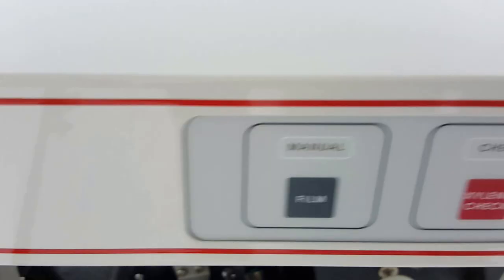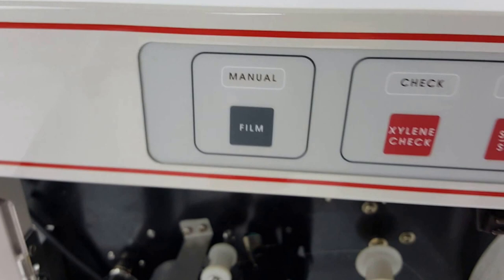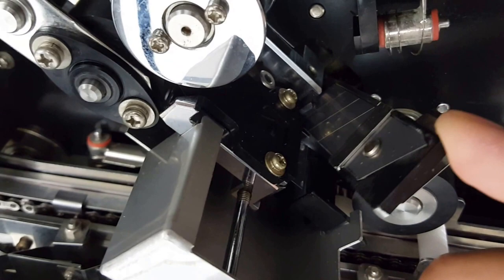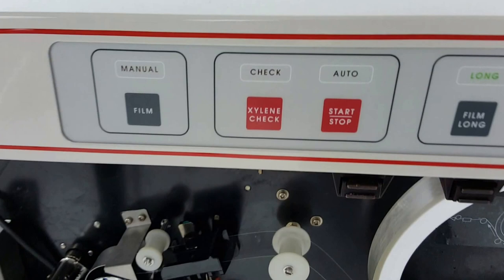It will advance up to the cutting blade by way of this button — the manual film button. When I push this, you can hear the solenoid click, and it will move and light up. I'm just going to cut that.